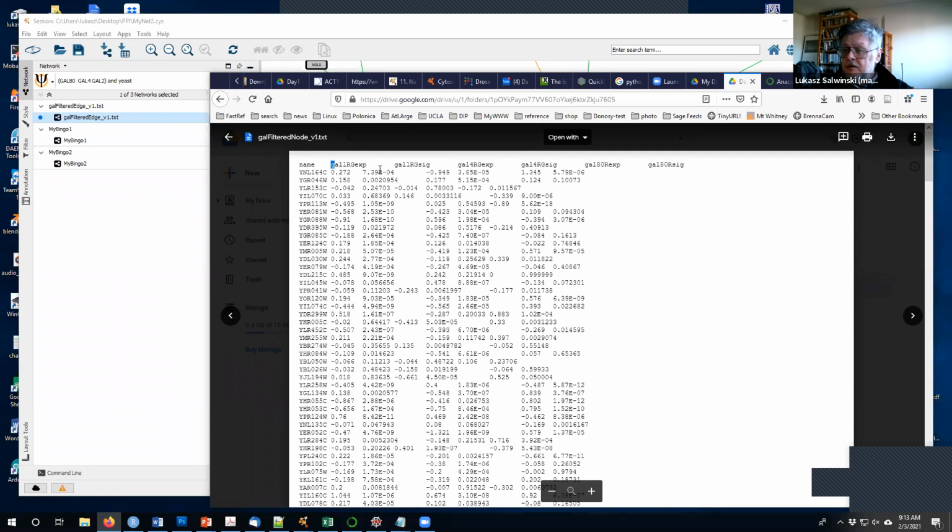They always came in pairs. There was a column with the log ratio of the expression in a given condition relative to some reference state, and then there was a number telling us what the significance of the change was, how reliable the result is. So this was the other file.